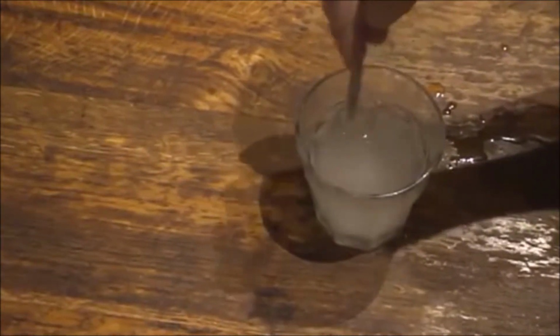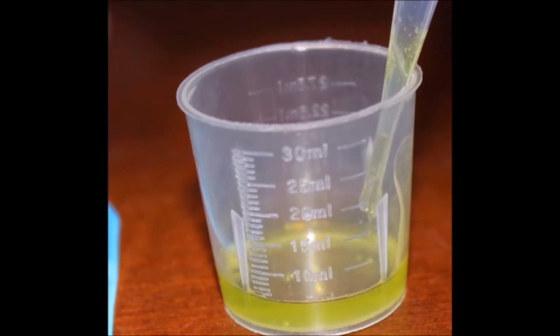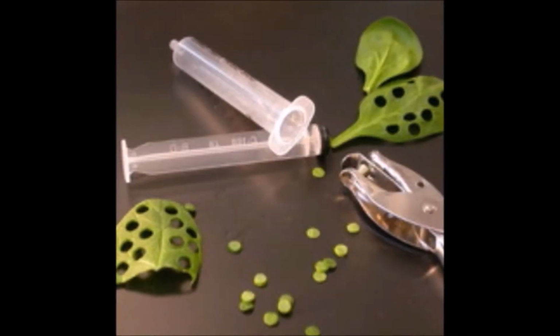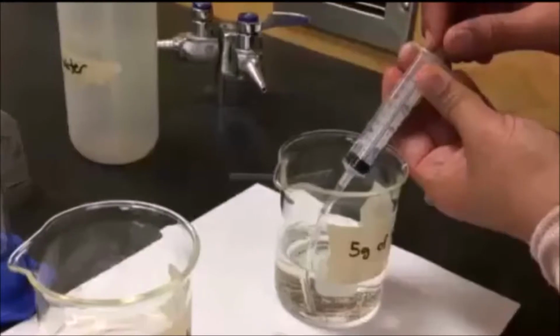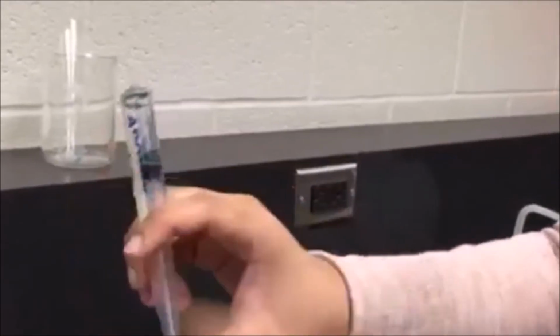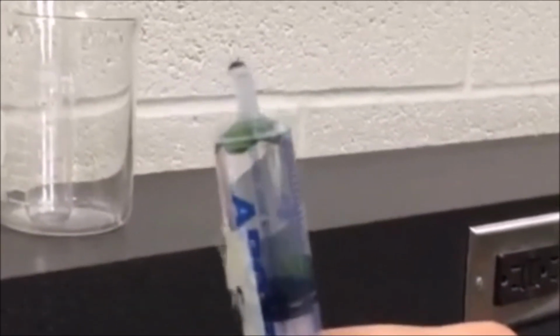Using a pipette, add 1 drop of the diluted soap solution to the bicarbonate solution. Stir the contents gently, avoiding the formation of suds. Pull the stopper out of the bottom of the syringe. Place 10 leaf discs inside the syringe and pull in 5 ml of the bicarbonate in soap solution. Aim the tip of your syringe upwards and carefully push the air out, avoiding the crushing of leaves. Tap the syringe so air bubbles are released out of the syringe.